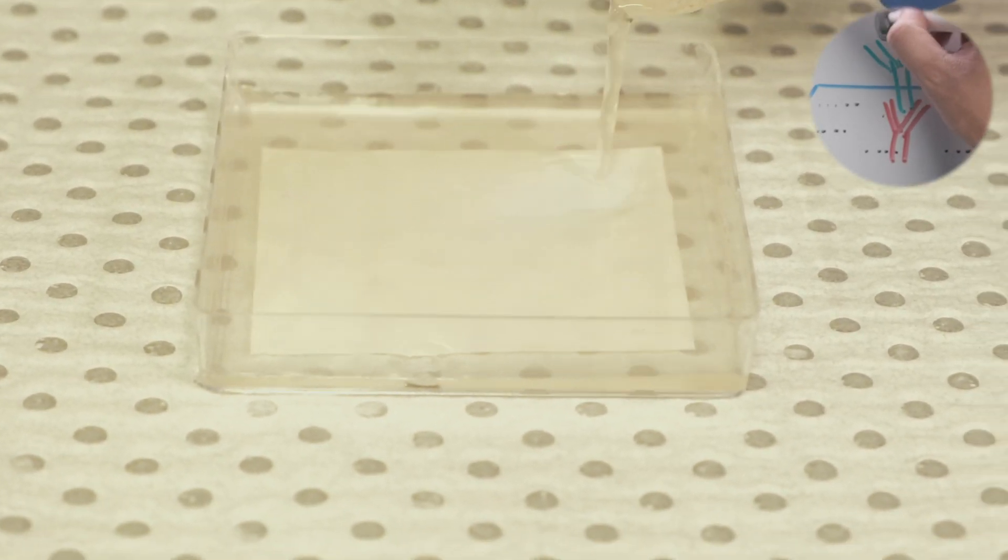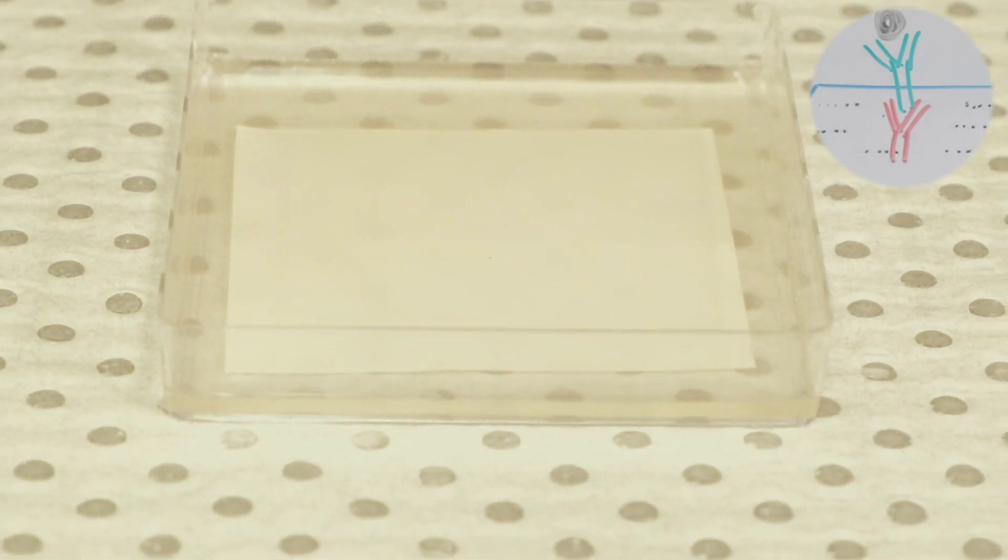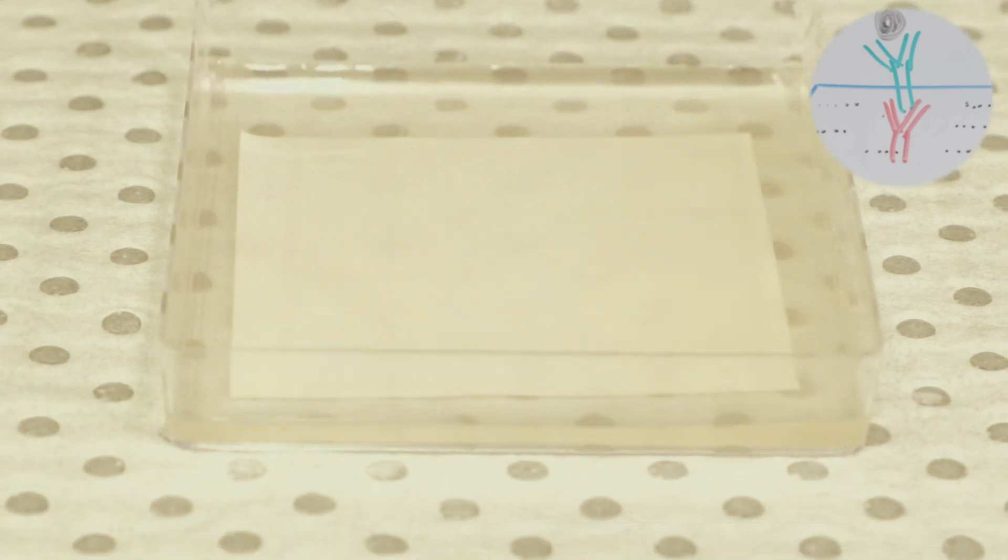The final step is the addition of substrate buffer. This is done once the secondary antibodies have bound and any excess antibodies have been washed off. Once the substrate buffer is applied, bands begin to appear on the membrane where the target proteins are located. This is a relatively quick reaction which occurs usually within 5 minutes of the addition of the substrate.